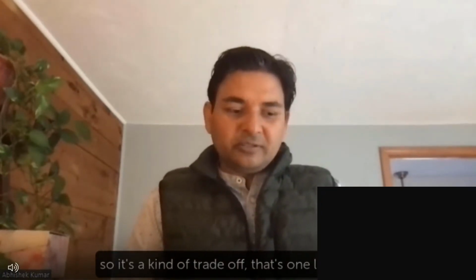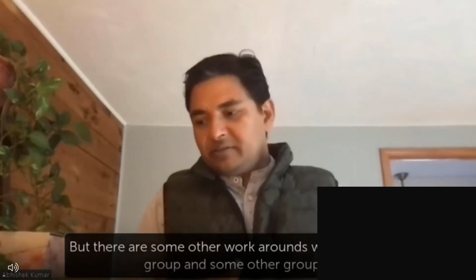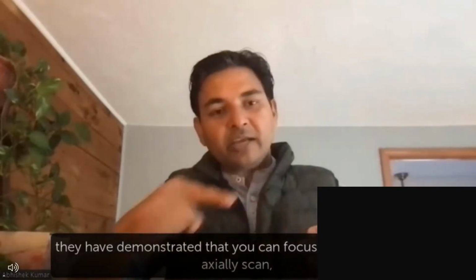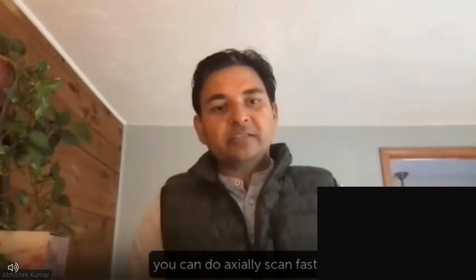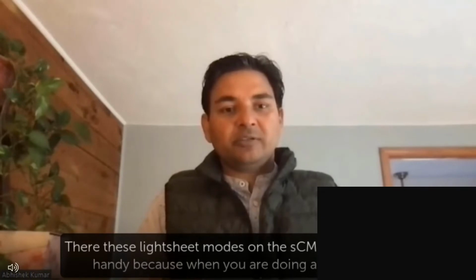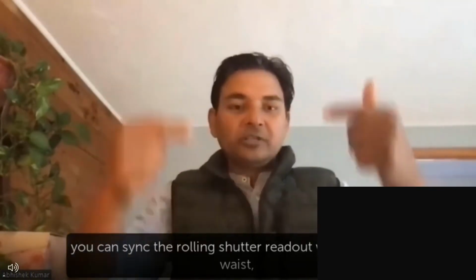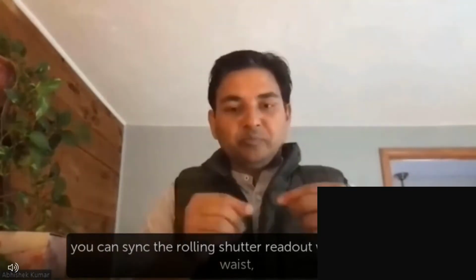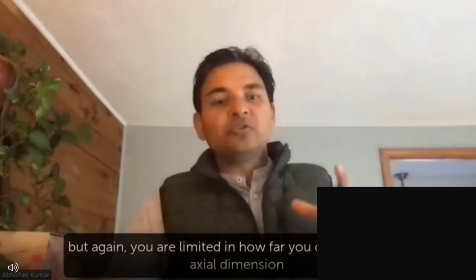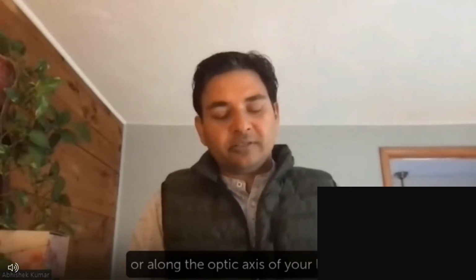So that's one limitation. But there are some other workarounds. Reto's group and some other groups have demonstrated that you can focus it tightly and do an axial scan. You can do the axial scan fast. And there, these light sheet modes on these sCMOS cameras are handy because when you are doing an axial scan, you can sync the rolling shutter readout with that beam waist. But again, you are limited in how far you can scan in the axial dimension, or along the optic axis of your lens.